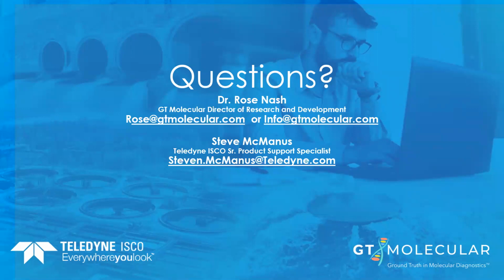Some people have shown data up to 4 weeks. Our experiment hasn't gone that long yet, so I can't speak to that. But at this time, I would recommend not holding your samples for more than 2 weeks at 4 degrees. A lot of our customers actually collect the sample and that day just transfer it to our bottles and ship it to us for analysis. And then it's really been stored at 4 degrees for only a couple of days. So you're definitely within that 2-week window that I recommend.